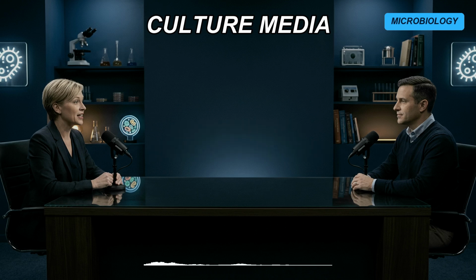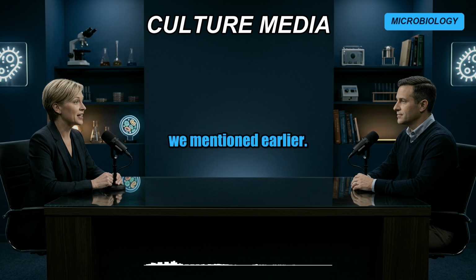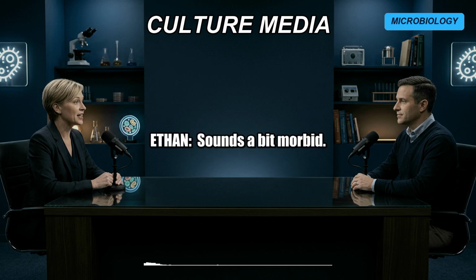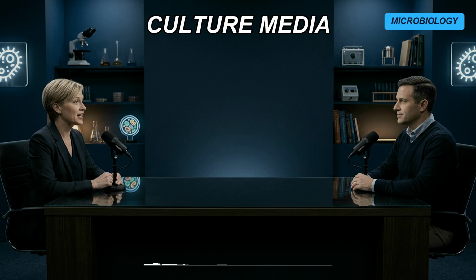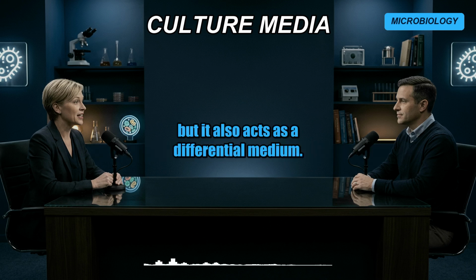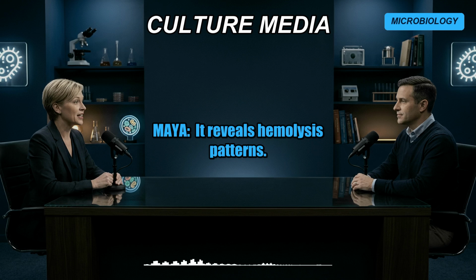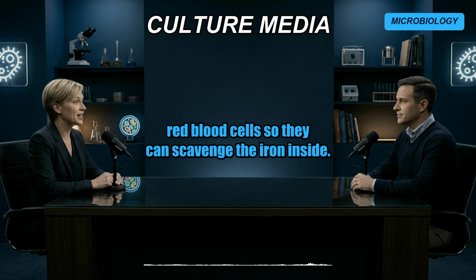It's brilliant engineering. Then you have enriched media for those fastidious, picky eaters we mentioned earlier. Blood agar is the standard here. Blood agar. Sounds a bit morbid. A little bit, yeah. It's a nutrient base with 5% sheep blood added. And not only does it feed demanding pathogens like Streptococcus, but it also acts as a differential medium. How does the blood differentiate them? It reveals hemolysis patterns. Hemolysis is the specific biological mechanism bacteria use to destroy red blood cells so they can scavenge the iron inside. Oh, wow.